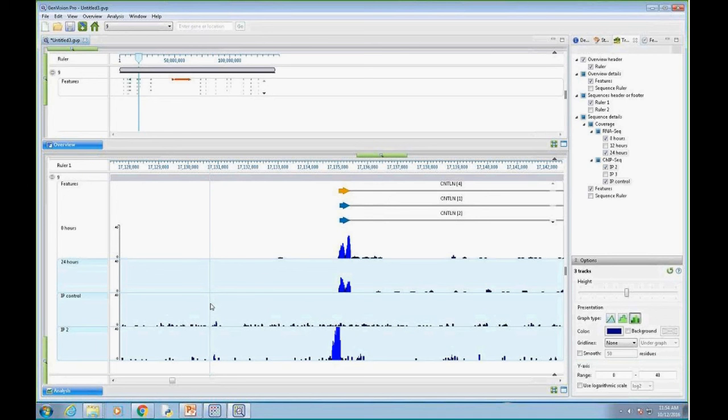And for our final question, I think you've already partially answered that with your last answer, and that is, can I combine assemblies that use different versions of the same genome, like different versions of the human genome? No, it's not possible to combine those. So whatever the genome is, you want to make sure that across the different projects you have the same reference genome for each one in order to combine them.